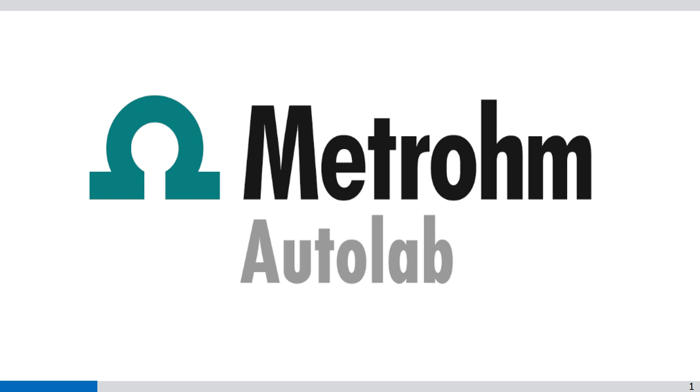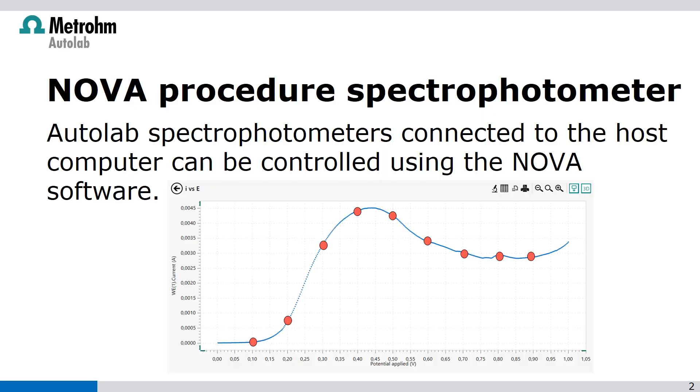Welcome to the NOVA videos. In this video I'm going to show you spectro electrochemistry with the use of the NOVA 2 software and the Outlab spectro setup.